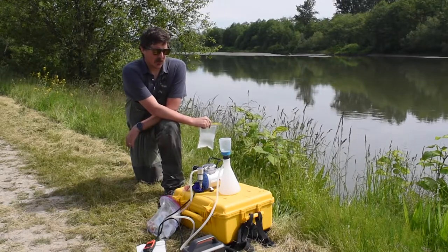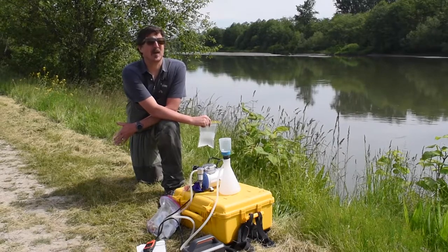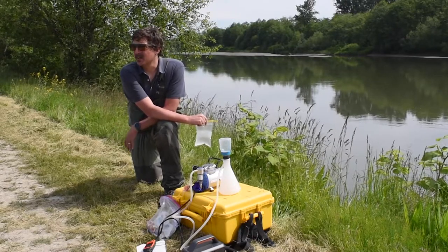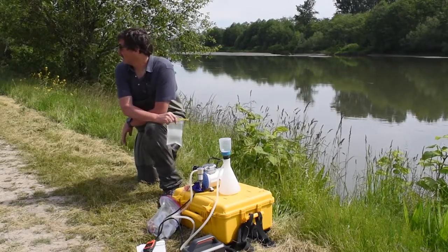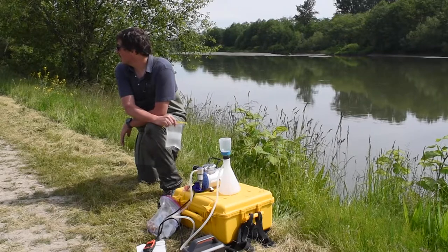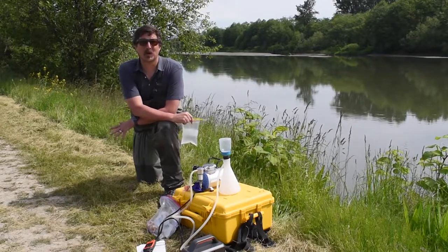It's something we started using out on the coast, and our process for collecting these samples has been evolving, thanks to the incredible community of biologists we have out there. This has really started from humble beginnings — Nicole has been there literally since the very beginning — to where we are today.